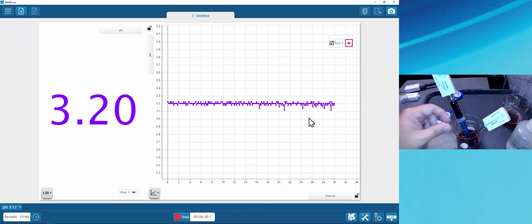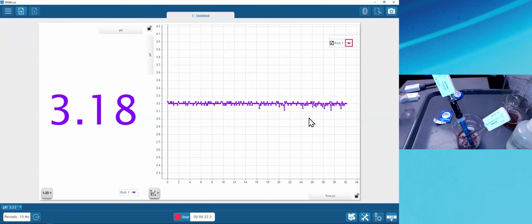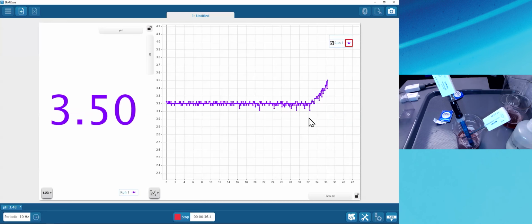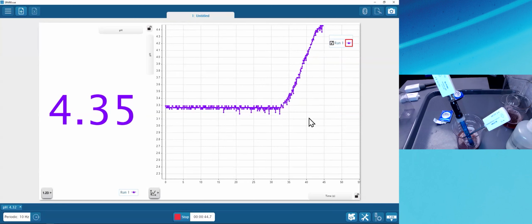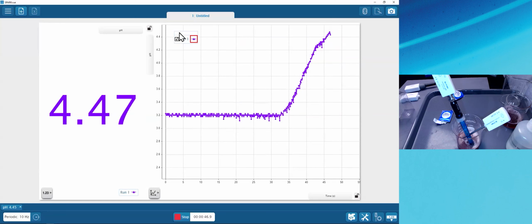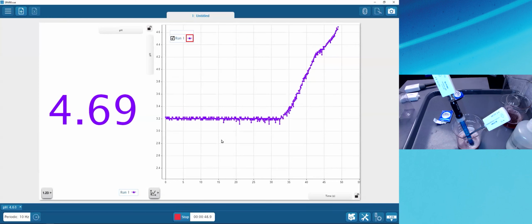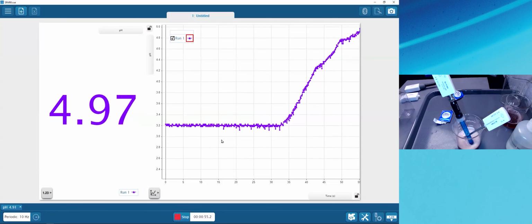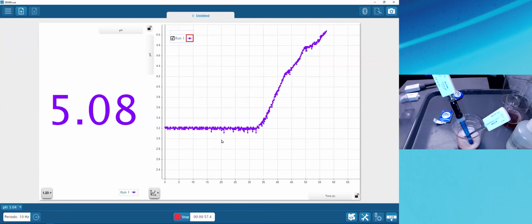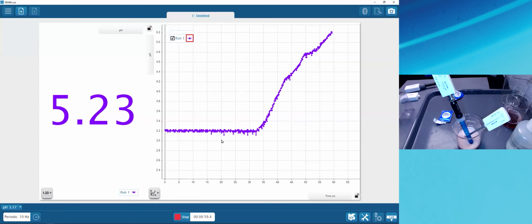You'll notice the graph automatically rescales itself by default to ensure all the data points are visible. I'll just simply put the Alka-Seltzer tablet into the juice, and let's see if we detect any change in pH from either the digits display on the left or the graph display on the right. Share your observations if you wish in the chat, or any surprises. Is this what you expected? This is an Alka-Seltzer Antacid tablet. Does it seem to be doing at least that part of its job?